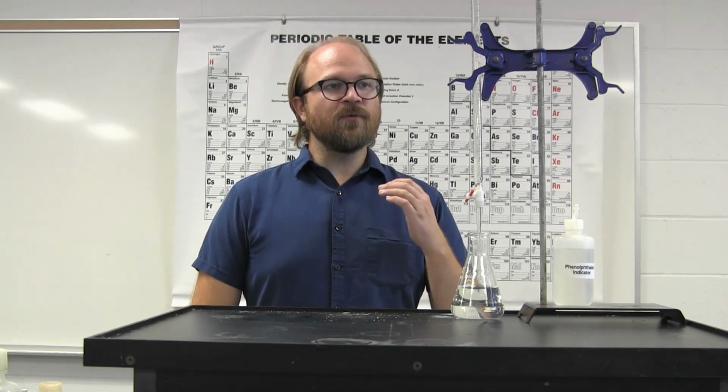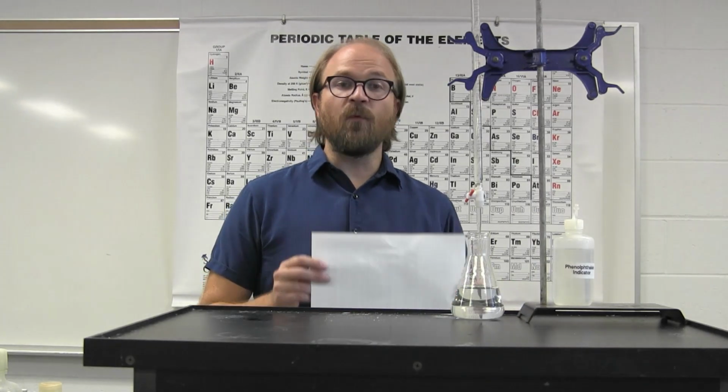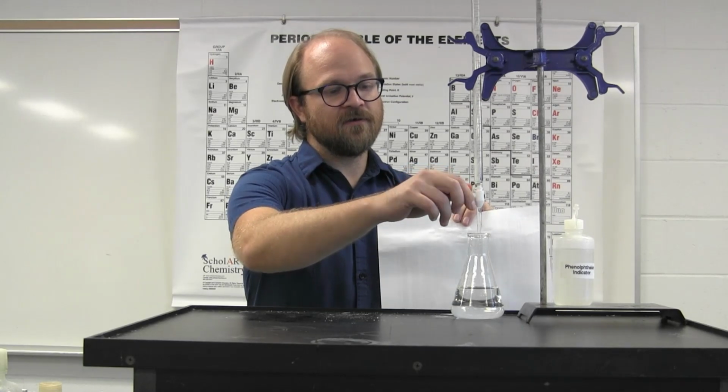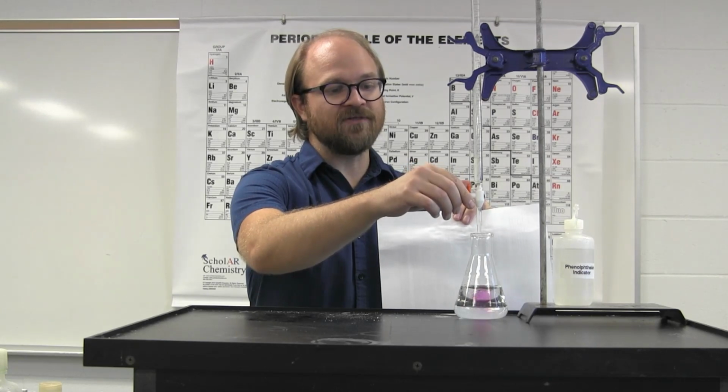When performing titrations, you need to make sure that you're recording the total volume that is added to the flask. So you need to make sure to record the initial volume reading of the burette and the final volume reading of the burette. The difference between those volume readings is the volume that was added to the flask. Many times it may be very helpful to use a white background to look at the slight color changes that are occurring as the titration progresses.